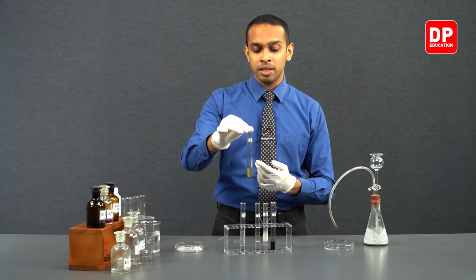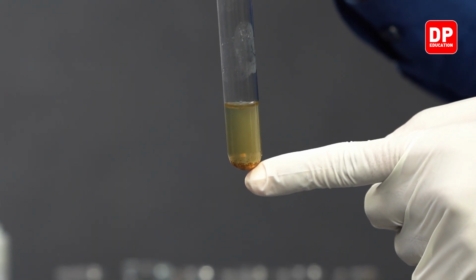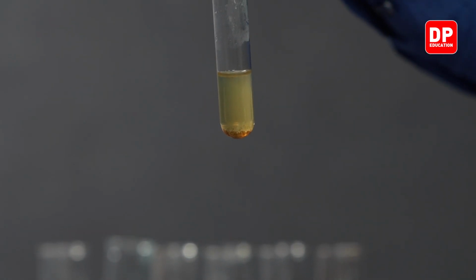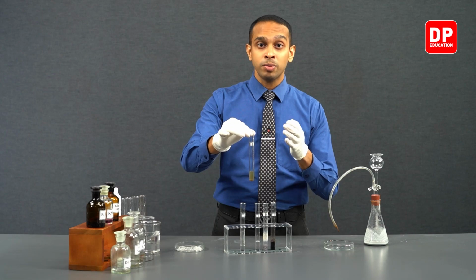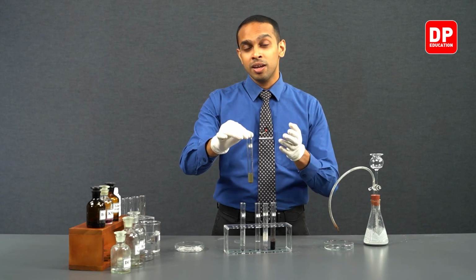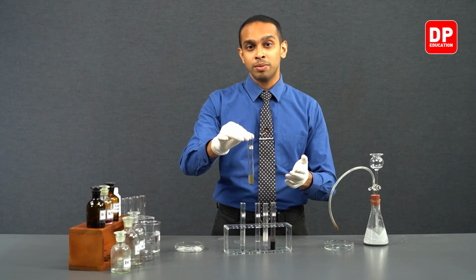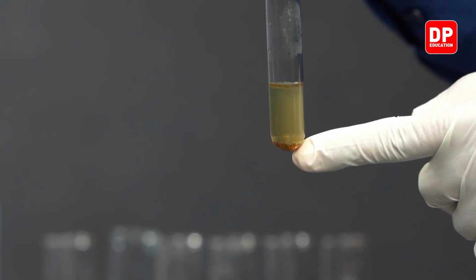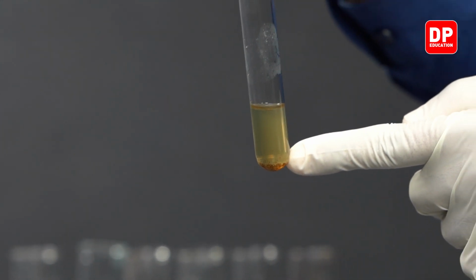You can observe here the brown color precipitate is now collected at the bottom of the test tube. We have left this precipitate to stand for a while. So as we formed it initially, it was observed as a suspension. But since it has been about 10 minutes from the time that we actually produced this manganese dioxide, we can see that the manganese dioxide precipitate is now collected at the bottom of the test tube.